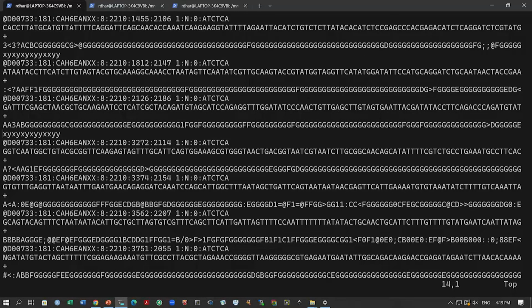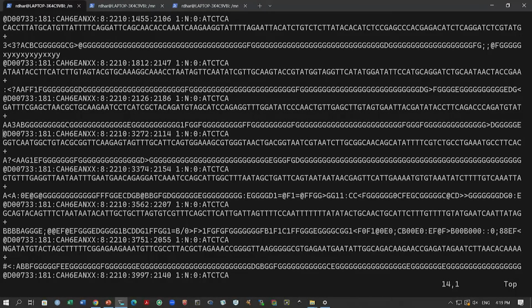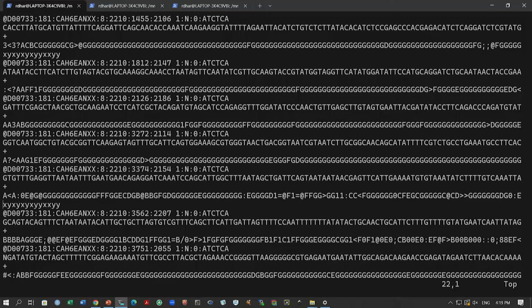So, that works by saying dd, small d's, twice. If you press these, this line will be cut, and if you want to paste it somewhere here, you can press P and it will be pasted here. Okay. Now, this is copying one line or cutting one line.